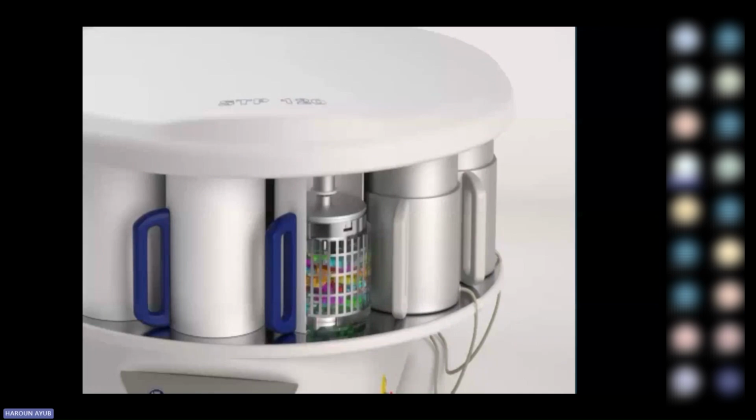So you have tissues that are on the outer side of the carousel, and also the inner part of the carousels, and they have to be mixed correctly. So this particular technology offers that. Then it also offers shaking, so that minimizes the transfer of solutions between bath A and bath B.